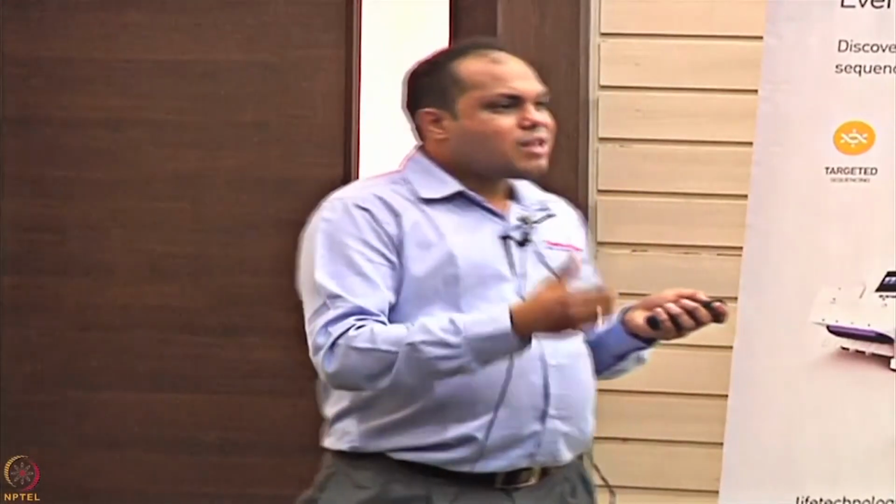So what you do further is, I give forward my designs, my hotspot regions of interest, and I could give certain parameters to call the variants. So variants could be called based on my somatic nature or else my germline nature, 50% frequency or else 5% frequency. And then the variants could be called at that stage.